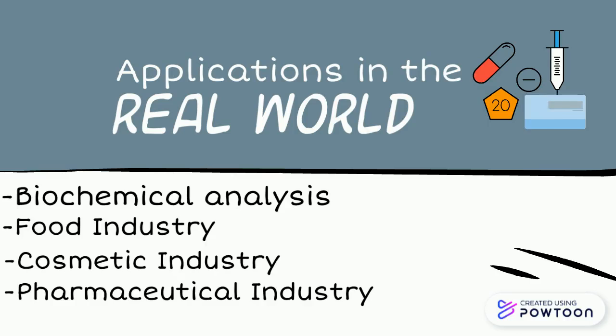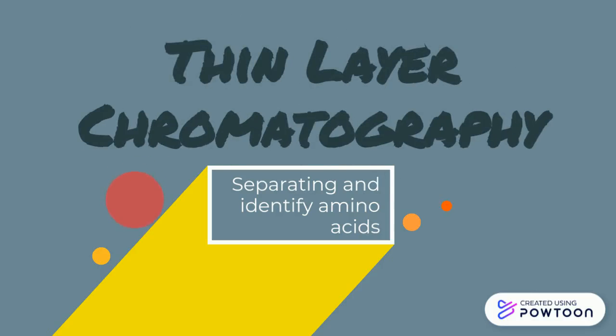Lastly, it can be used in the pharmaceutical industry to separate multi-component pharmaceutical formulations and to test medicines such as anesthetics and antihistamines. Therefore, separating and identifying amino acids through thin layer chromatography can be explored by identifying the interactions between chemical concepts and real-life applications.